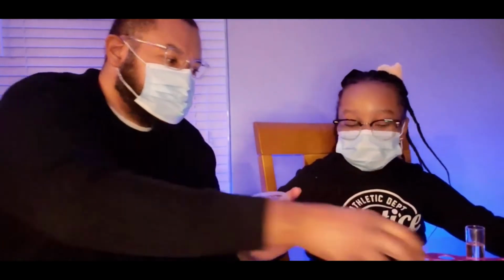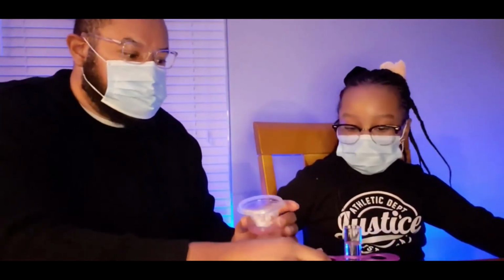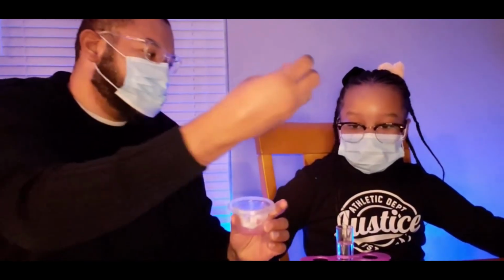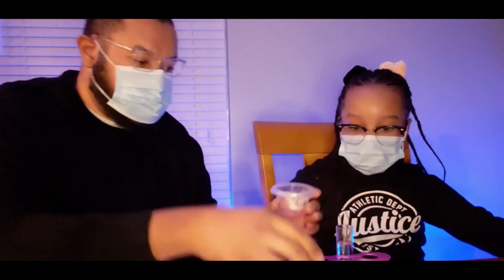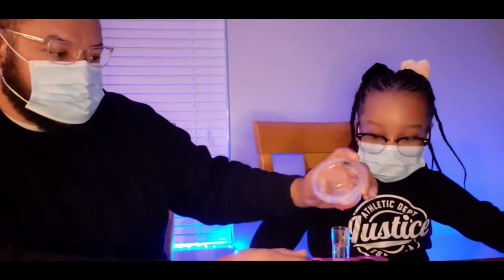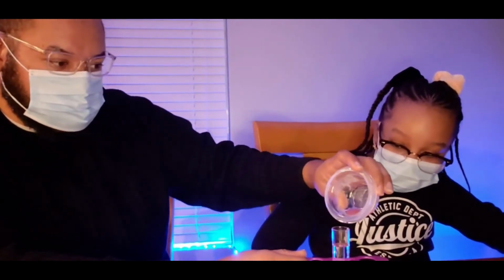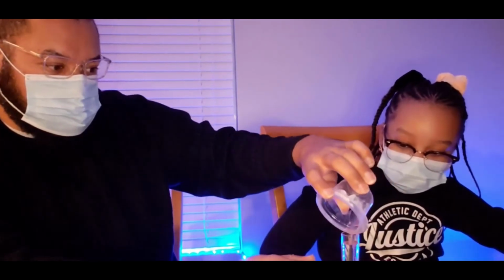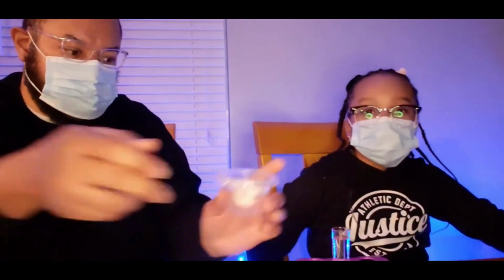All right, so we're gonna pour this into the alcohol in the test tube, and then Brooklyn's gonna quickly put the cap on it. Okay, you ready? Okay. This right here could put off some vapor, so that's why we're wearing the mask. All right, put the cap on it.